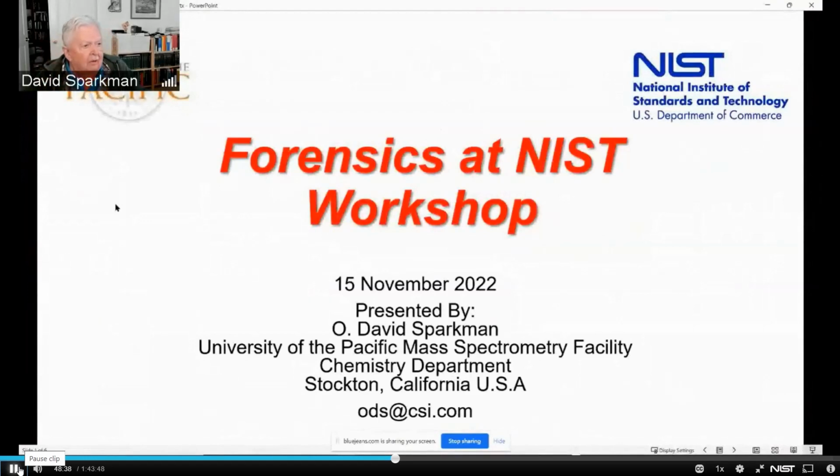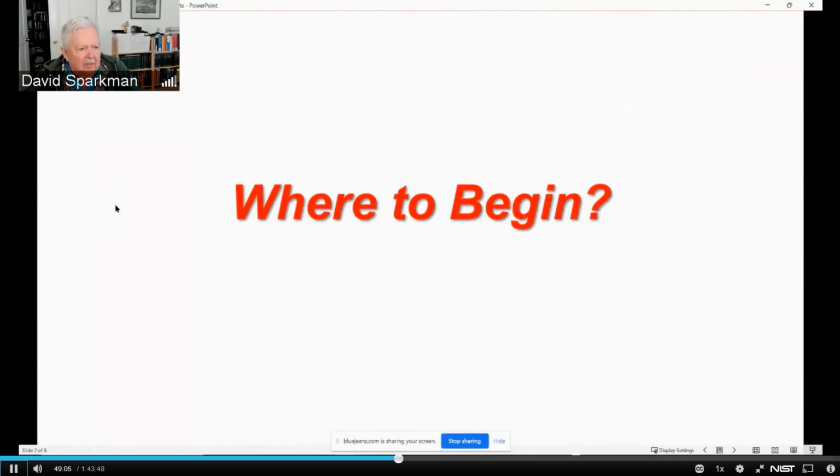So the title of my talk is the Forensics at NIST Workshop. And I'm going to talk to you about some different ways of dealing with mass spectral data, not just doing library searches and other things. So when you sit down to solve a problem with GCMS, where do you begin? What is the starting point?